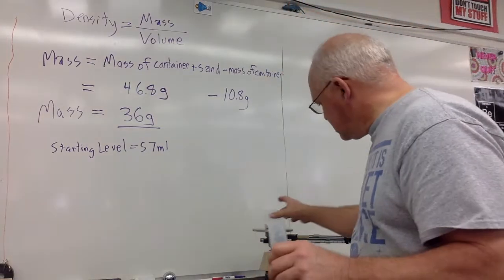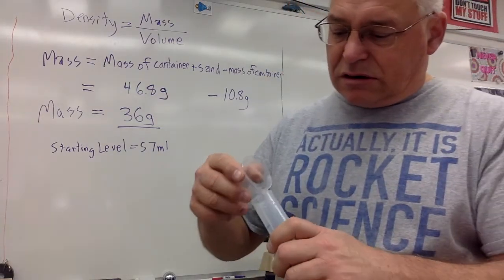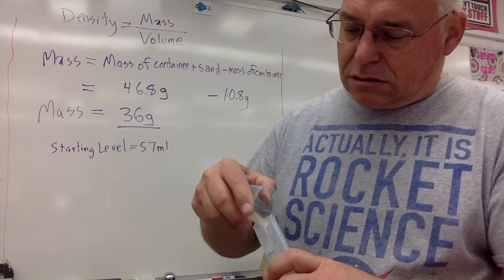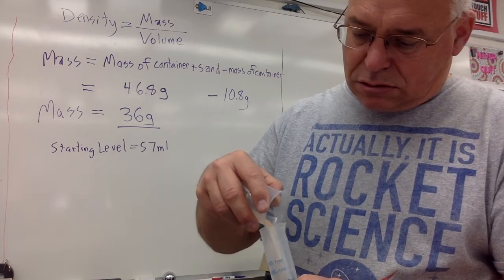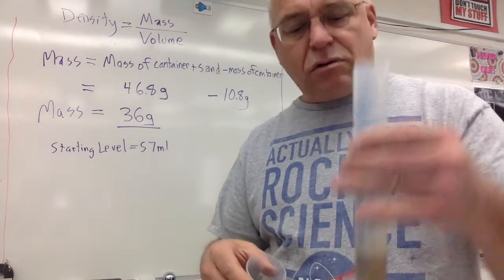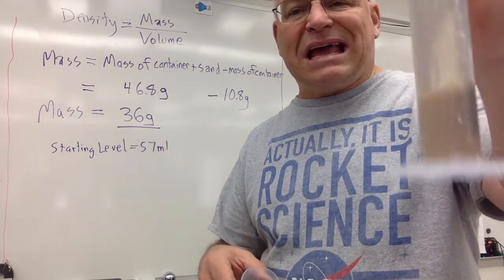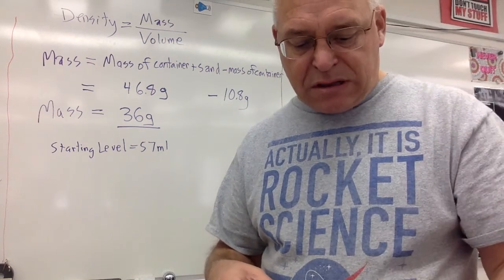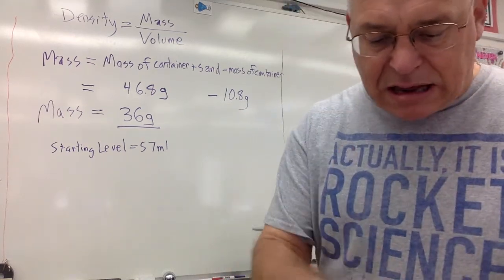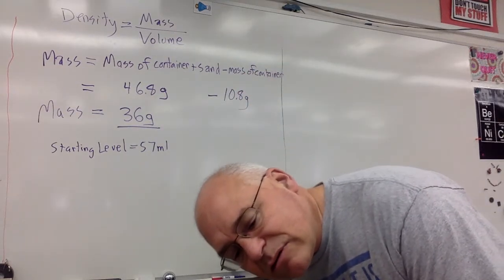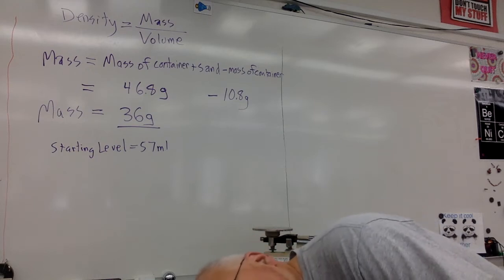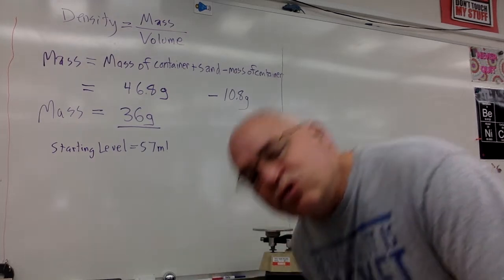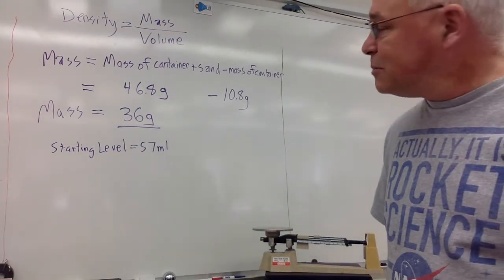Now, I'm going to put the sand in the graduated cylinder. So, now we've got the sand and the water in the graduated cylinder. And I'm going to read that now. The sand brought the level of the water in the graduated cylinder up to 70. 70 milliliters.